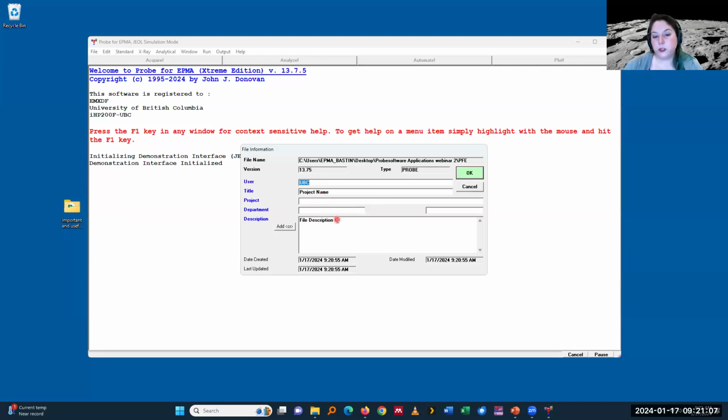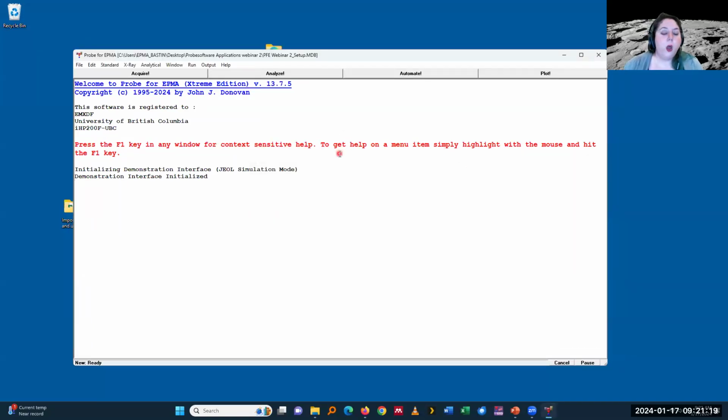There's a little utility tool that can read out all that information. You can search over it. So if it's important how you bill or how you keep things, it can be very, very useful. Okay, good. First, a few words about the structure of the software.